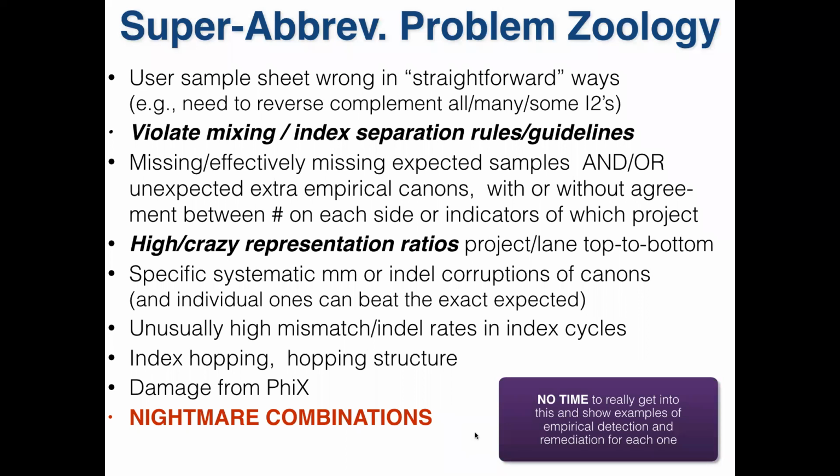But if it's a really big mix, like a mix of 100 where only 2 are missing, the demux fail can't really tell you whether they're there. It's just too small to vary, especially if the lane representation varies. Those create lots of trouble, but oftentimes you can recover them because they're sitting there.